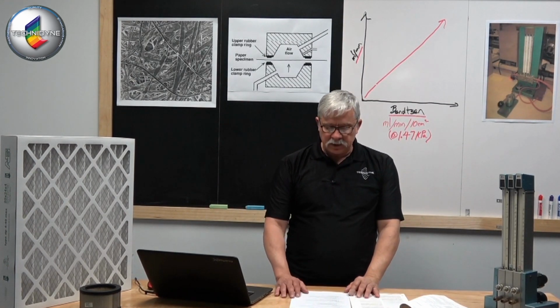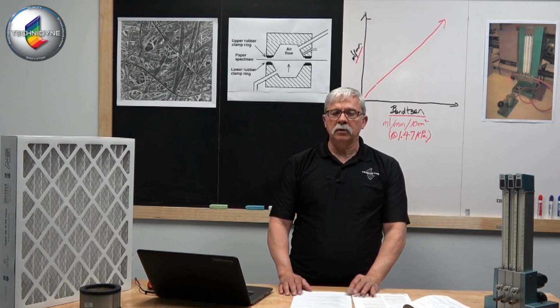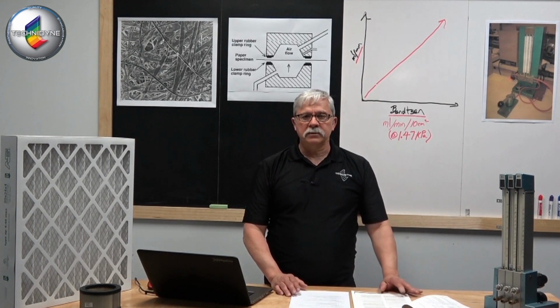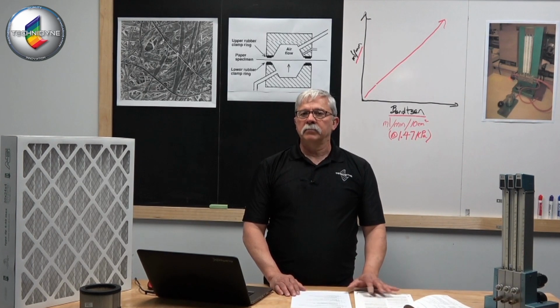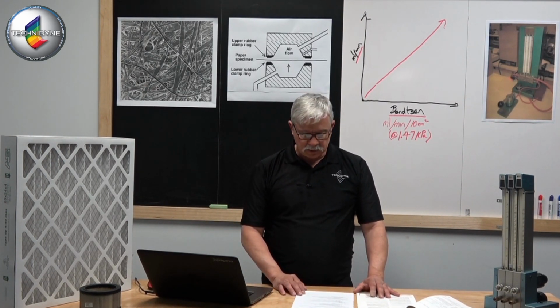The Bendtsen test, as I mentioned, really took off and was very popular in Europe. Today, I still see it here in the States. I'm not sure about South America, but certainly in Canada, this test is being used for exporting applications, especially if we're going into the European marketplace.